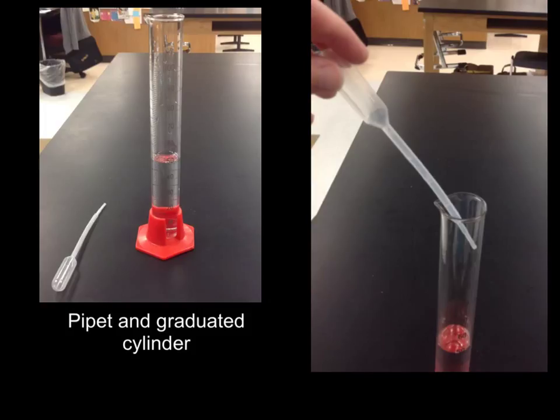You're also going to be using a graduated cylinder. This one is specifically for measuring up to 100 milliliters. This is what you're going to use to measure exact volumes. You're going to be using a graduated cylinder of some size. We have 10 milliliters, 50 milliliters, 100 milliliters, and even bigger, but these are going to give you exact volumes.